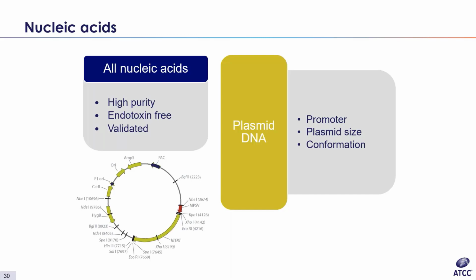Plasmid size is also a concern. The larger the plasmid, the lower the expected transfection efficiency. You should also verify that you are using a complete sequence in your plasmid. DNA plasmids that have been stored for some time can become degraded or nicked.